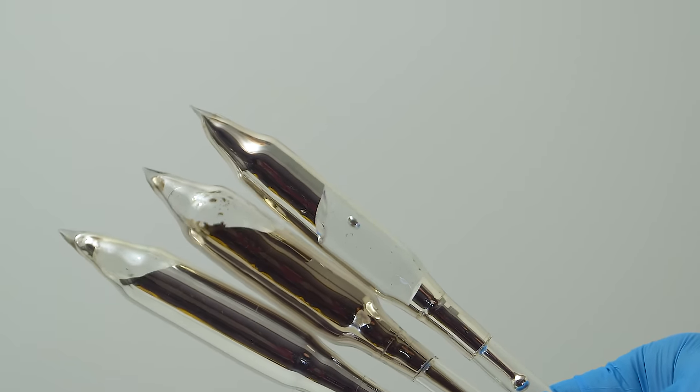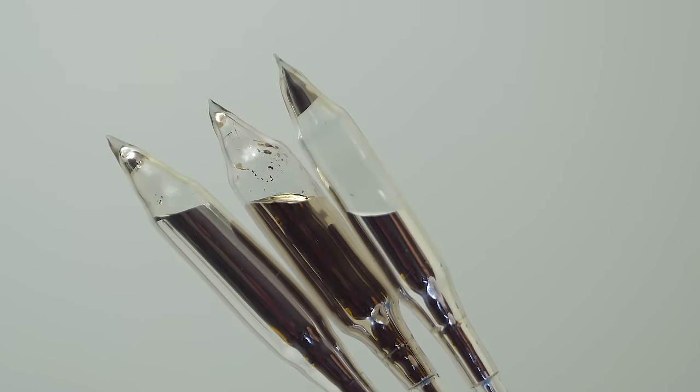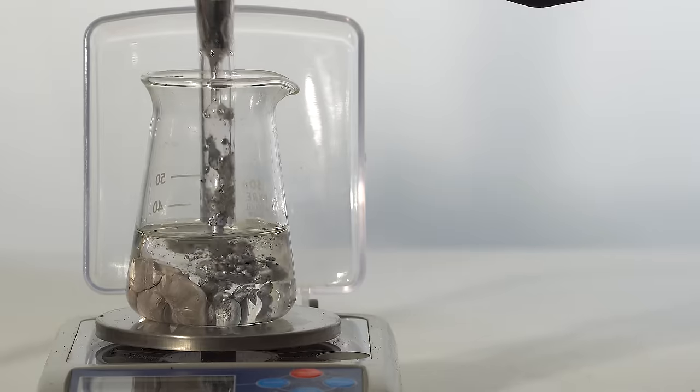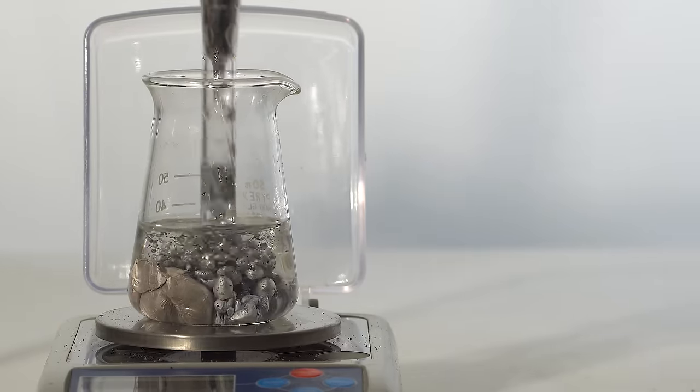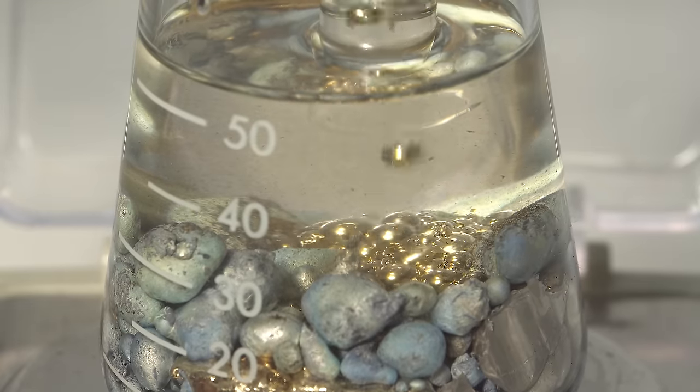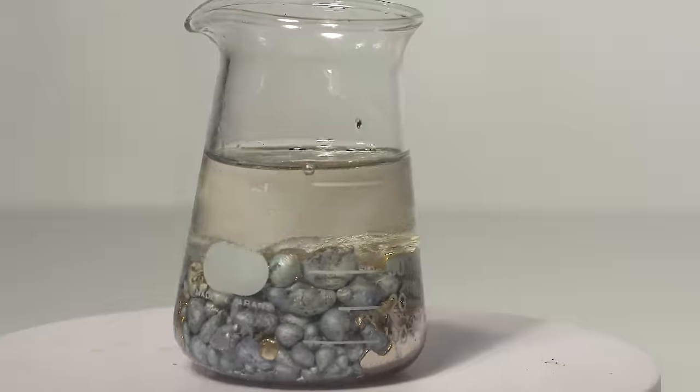In order to obtain a liquid from them, they must be either heated or mixed with each other. Now, I pour liquid cesium from the ampoule, and it's already beginning to dissolve potassium and sodium.